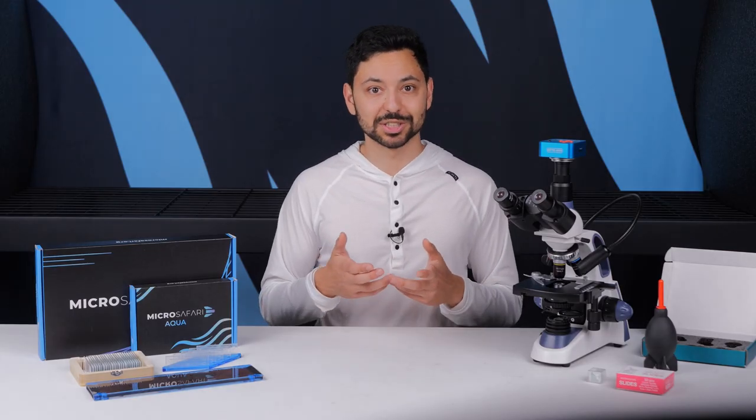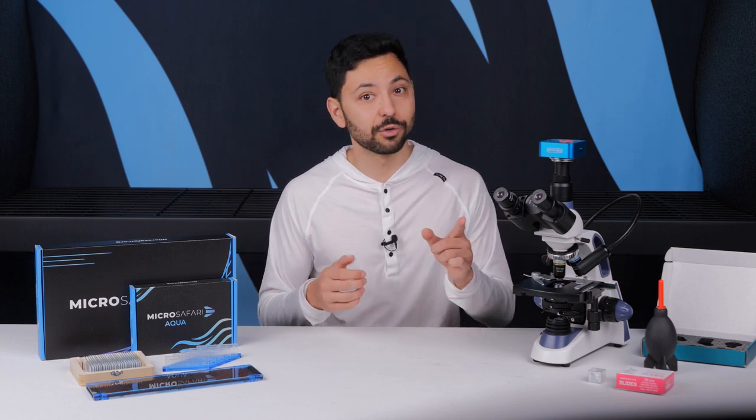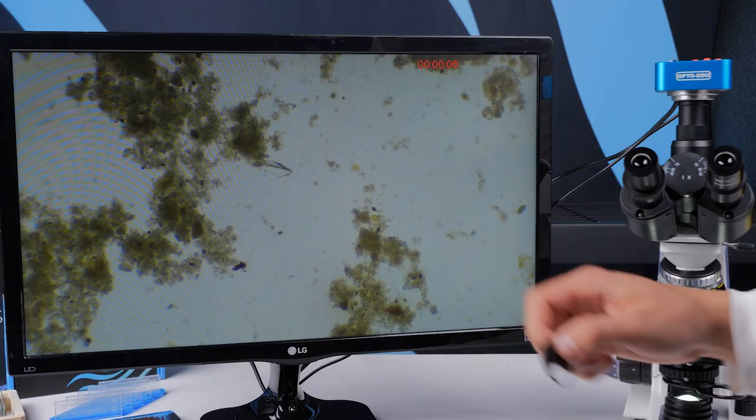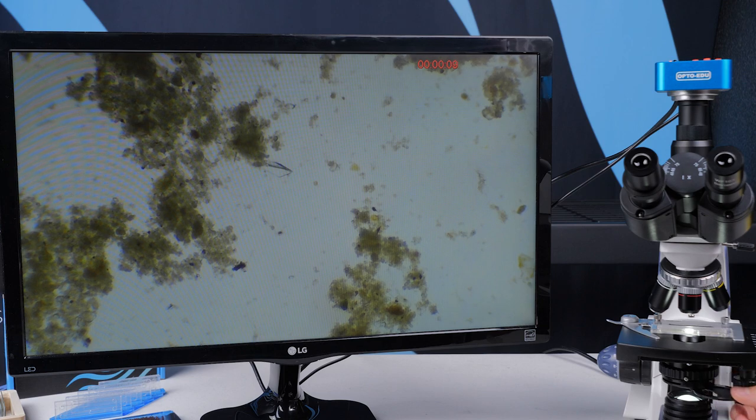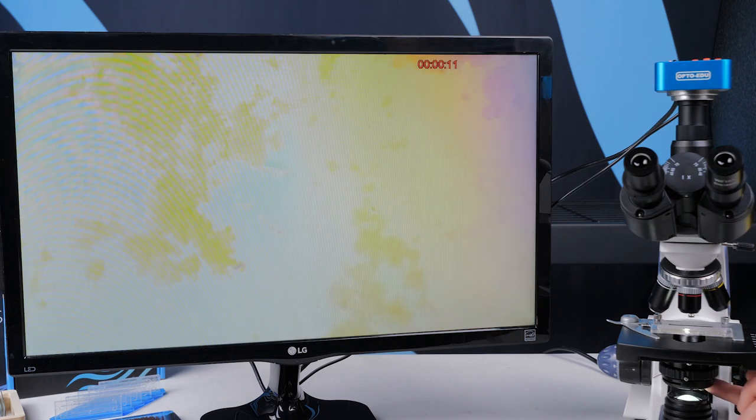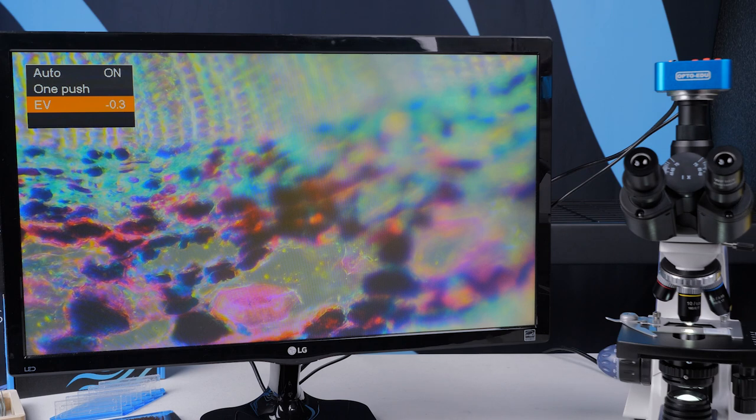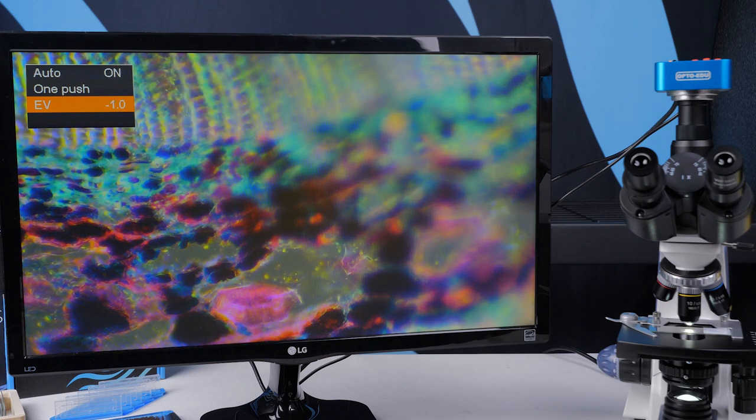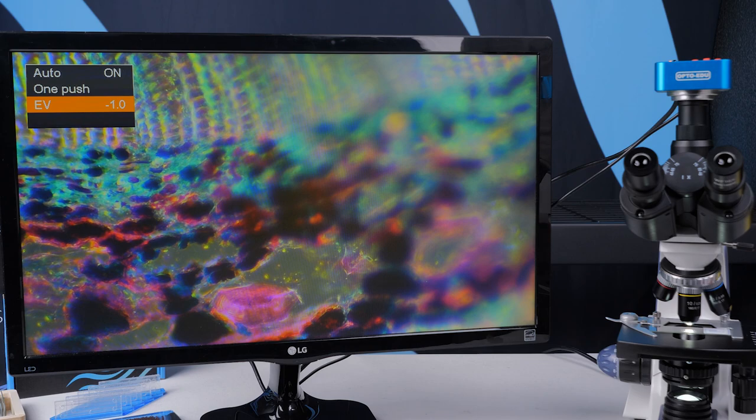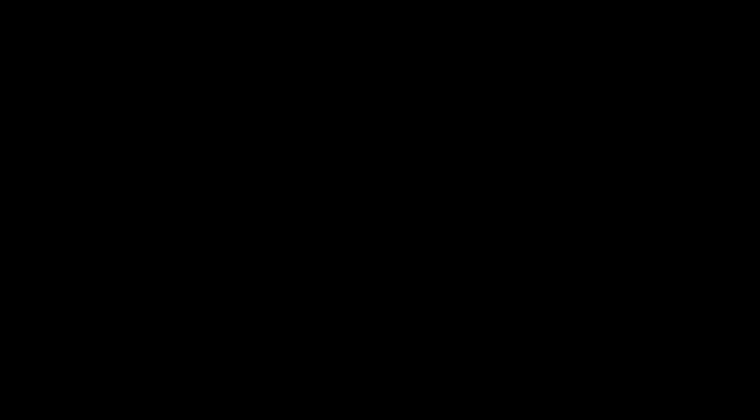Here are a couple of darkfield tips. This darkfield setup works best on the 4x and the 10x objectives. The oblique illumination filters work exactly like darkfield but illuminate the sample from one direction giving kind of a three-dimensional effect. If you're using the camera with darkfield you may need to manually adjust the exposure and darken the image until the background is as black as possible and your sample is not overexposed.